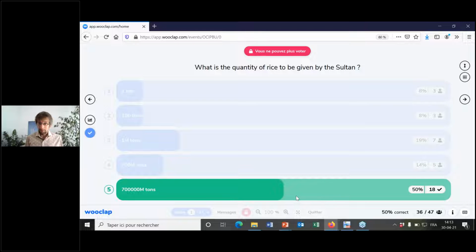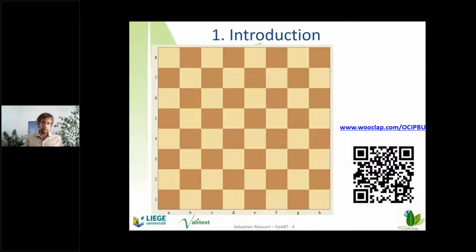And this is important to have in mind because, in fact, most of the people don't have in mind the importance of the exponential and how it can change the game. And that's the point here with high throughput sequencing. This exponential evolution changed the game, and will continue to impact the research, but more and more also the diagnostic too.